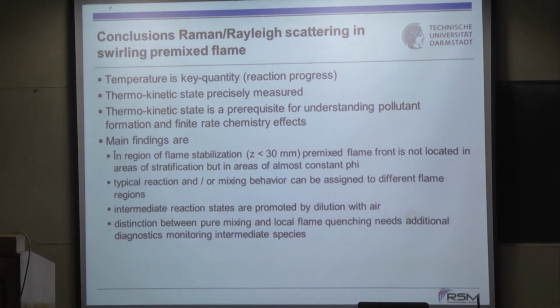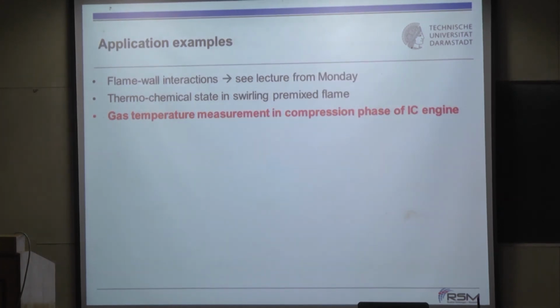Now you have really thermal-chemical states accessed, and you have turbulence chemistry interaction quantified this way. And thermometry is the base of that, but extended to chemical species measurements. Because time is marching, maybe I go on, unless you have questions. We should always have time for questions.